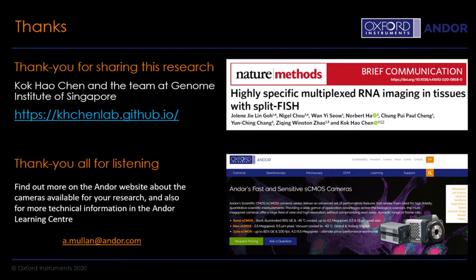But in theory, the multiplex FISH approach has already been shown by others to be able to image the whole transcriptome. I thought that should be very exciting because it allows this unbiased approach for us to answer any kind of phenotype genetics question that people have.